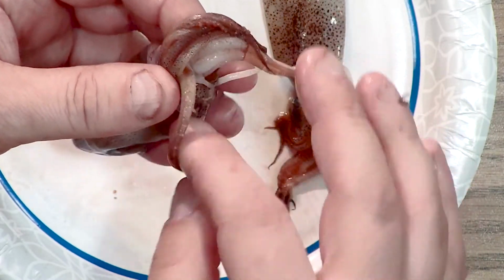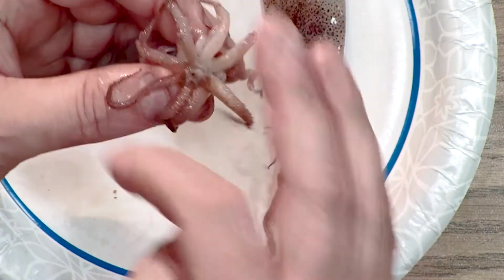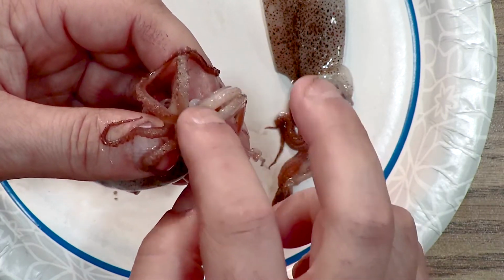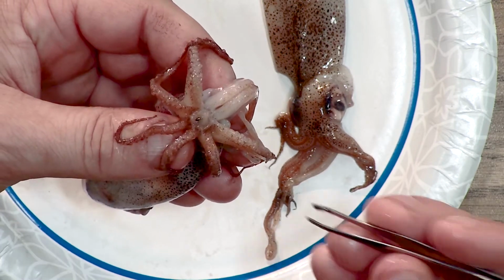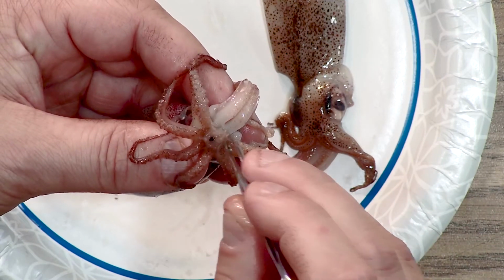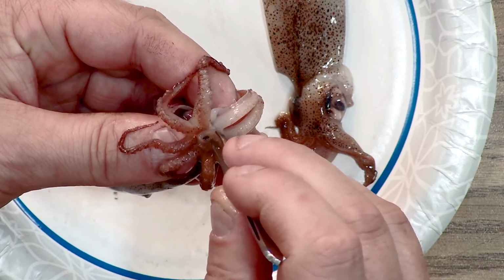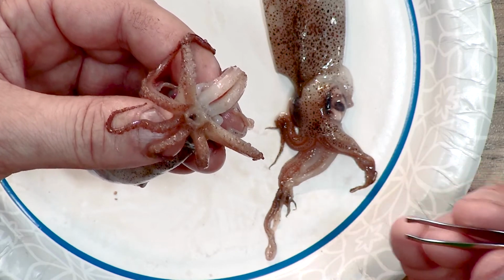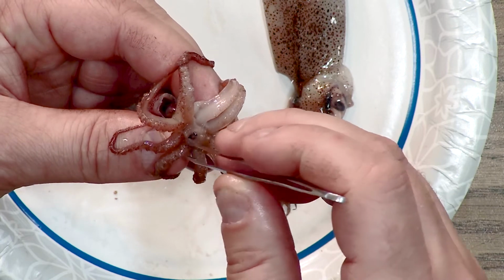Once I'm feeling comfortable, I'm going to turn it upside down and I'm going to look at the bottom area here. Now, this is a great camera shot you're getting of the mouth down here. Now, inside this mouth area, you can see that there's something black inside there. And this is actually the beak of the squid. This beak is a lot like a bird beak. It's got a top and bottom jaw that come together into a pinch.